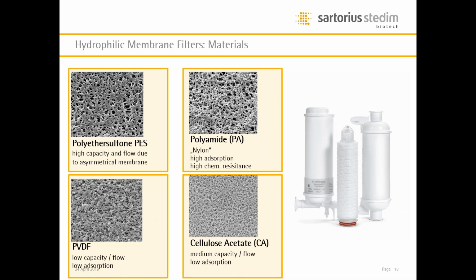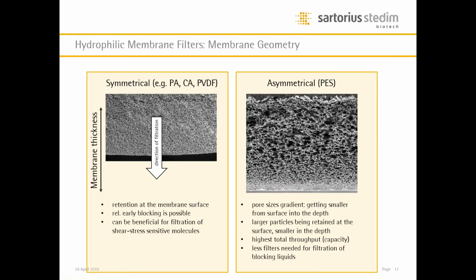And so you see, depending on the need you have for your filtration process, you can select one of those different materials. For all the materials, of course, it has to be guaranteed that sterilizing grade filtration is done. I briefly mentioned the different symmetrical and asymmetrical membranes.